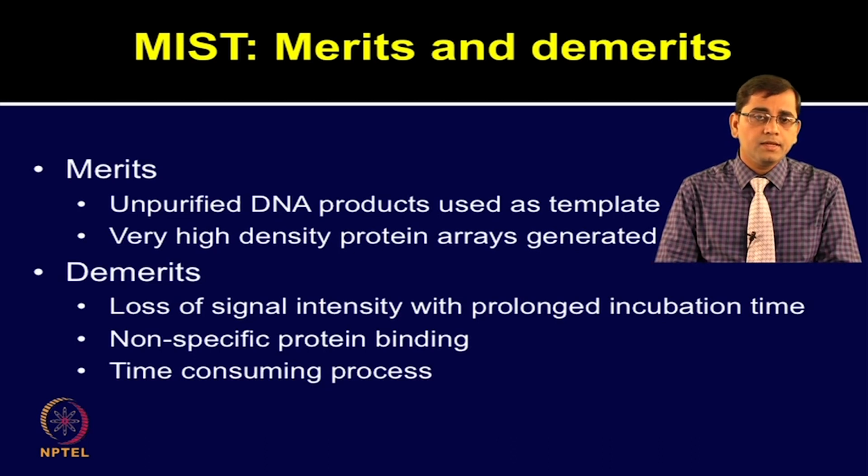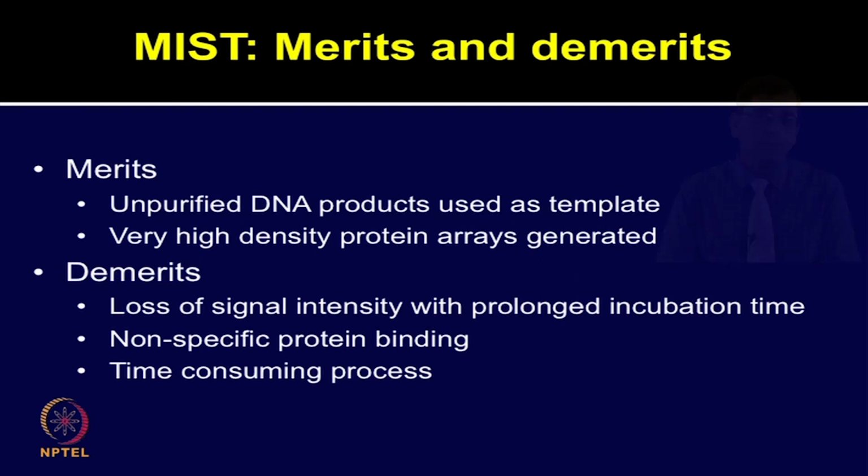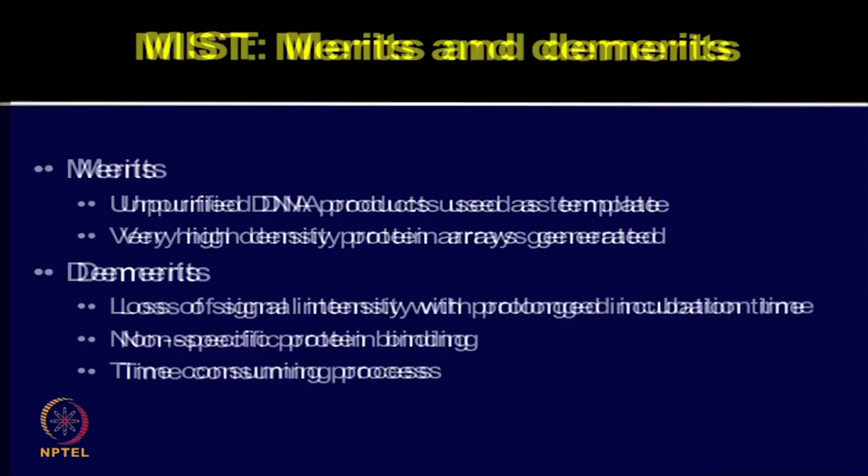Since in this case even the cell-free expression system is printed on top of the arrays, stability could be one of the major issues. The non-specific protein binding as well as the overall process being more time consuming are some of the other limitations of the MIST technique.